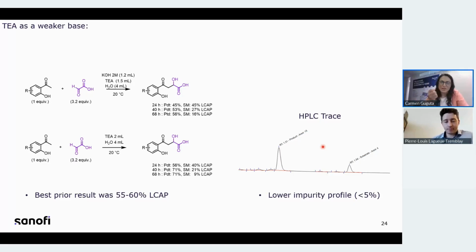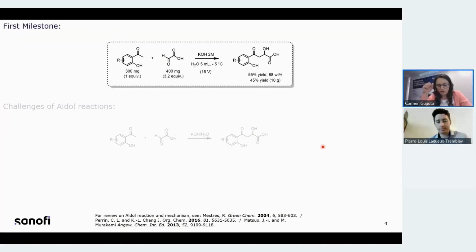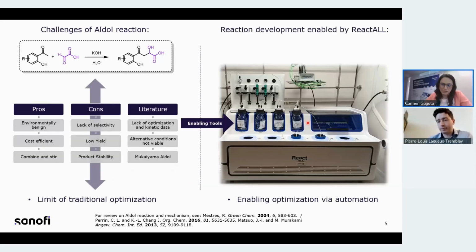Then the valve closes, and from the side through this smart cap comes the quench and the dilute. So immediately your sample is quenched, diluted, and pushed by making use of nitrogen through the lines directly by the needle into your HPLC LCMS vial. At the end of the sampling, more nitrogen is purged through the lines to make sure that all the sample is in the vial and nothing is left over.